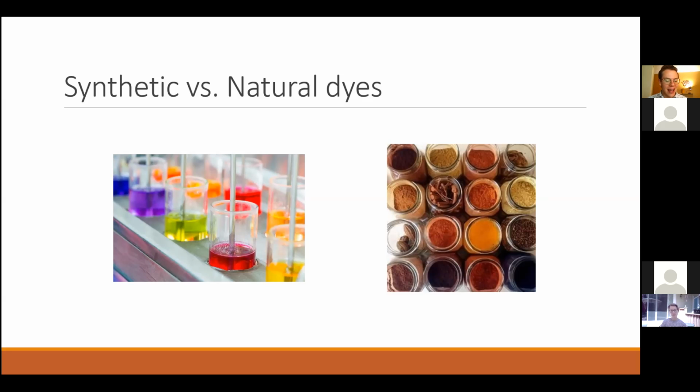It's not nearly as energy intensive, time consuming, or costly to use natural dyes as opposed to synthetic dyes. And often natural dyes are less hazardous than synthetic dyes, in terms of green chemistry. Then there's a lot more reason to use natural dyes.